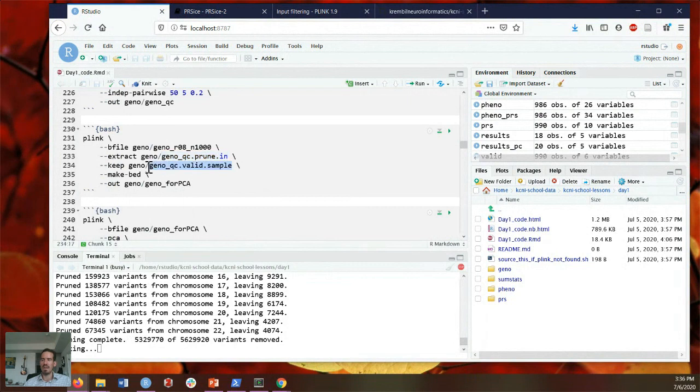It removes those 10 that have high levels of heterozygosity. And then this make-bed command will actually now, instead of just giving us those quality control files like lists of SNPs or lists of subjects, regenerate the entire BIM, BED, and FAM trio of files. And all three of those files will have this Geno4PCA prefix.